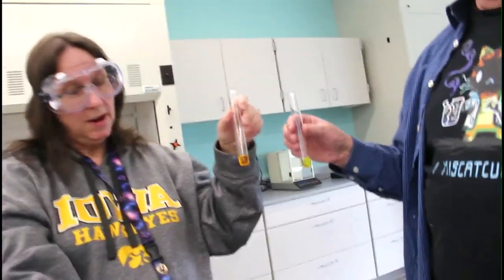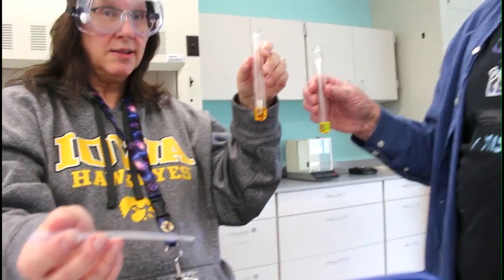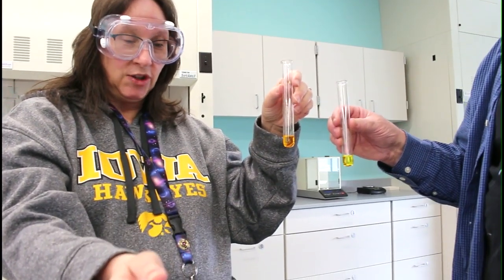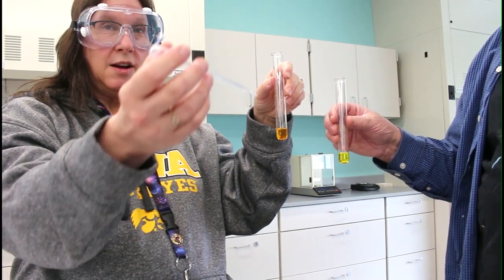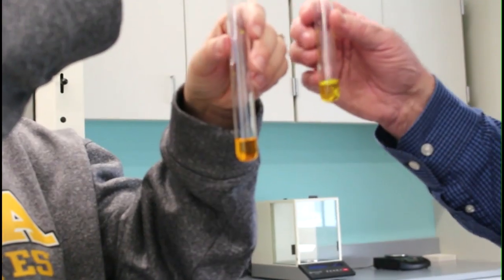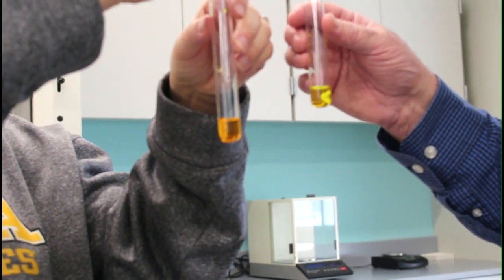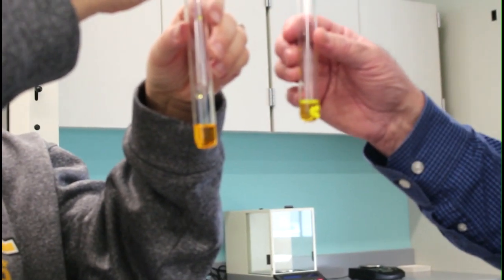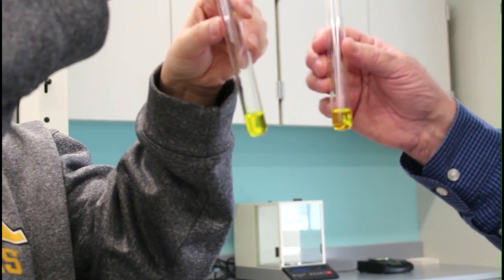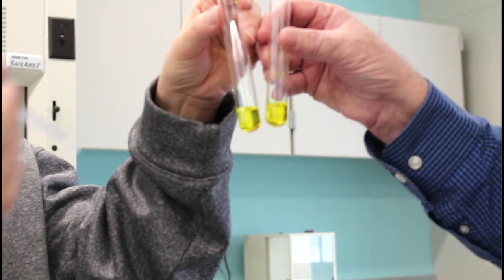about in Chem 1 was how hydroxide, OH, would react with the H pluses I've added in the form of H2SO4. So of course, NaOH is going to gobble up some of those H pluses and form water. So we'll be removing H pluses. See what happens. 1, 2 drops. Oh, wow, 2 drops. Ding, ding, ding, we have a winner.